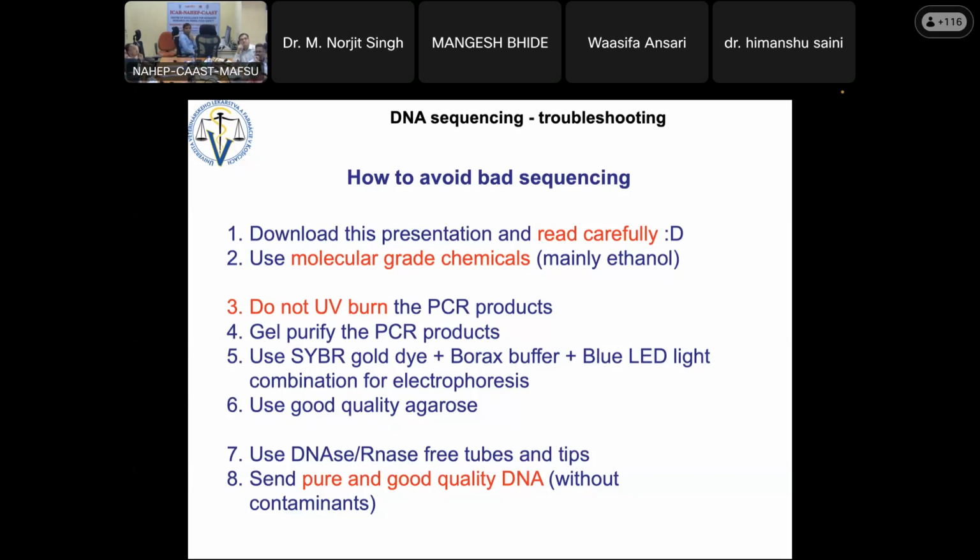If you don't have that much money, the simple trick is to do a freeze thaw of your tips. Put them at -80, then put at 50 degrees Celsius, do it 2 or 3 times, and the DNases will be degraded, because DNase is also an enzyme or protein, so it degrades by freeze thaw.